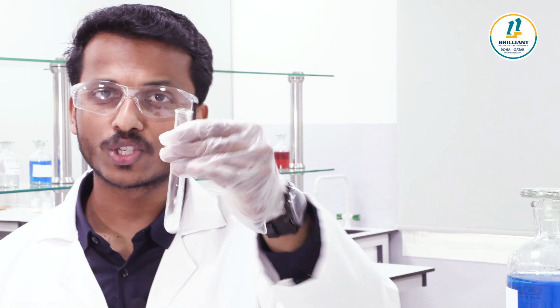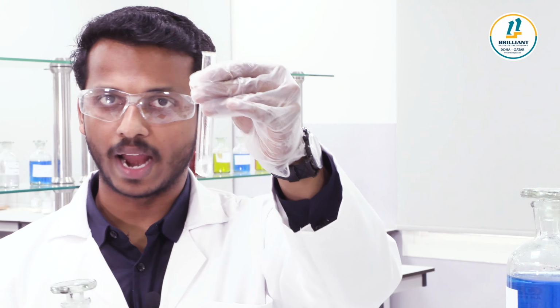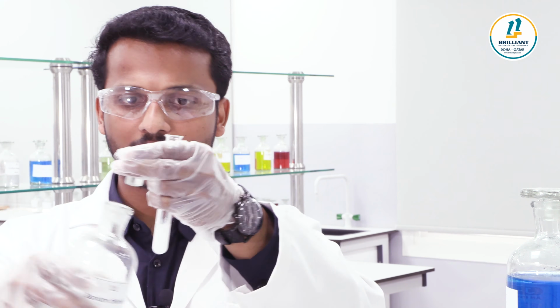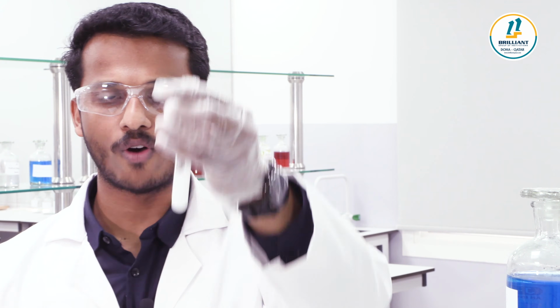To the salt solution, we have to add barium chloride. This is the barium chloride solution. It will be available in your lab. So barium chloride solution, we have to add into this one. See what is the observation. I'm going to add barium chloride solution to this one. You can see that a white precipitate formed, right?